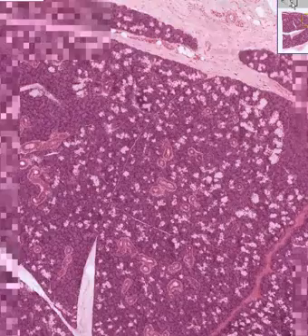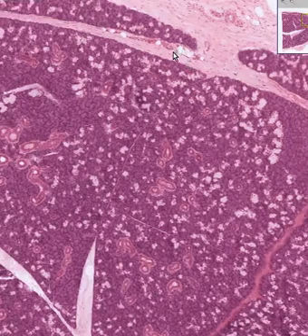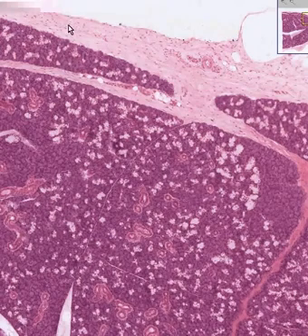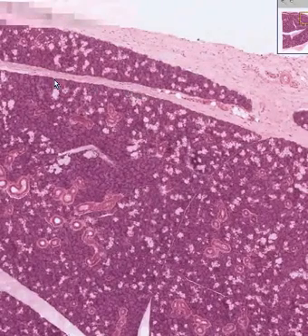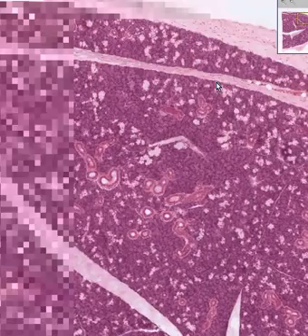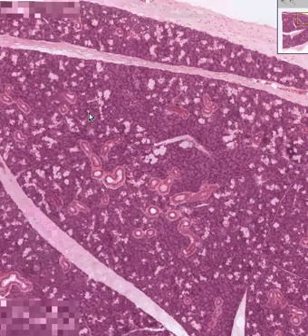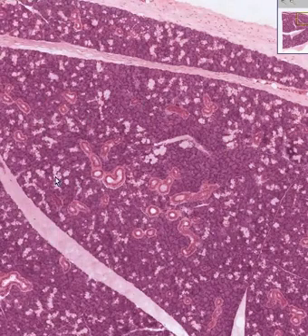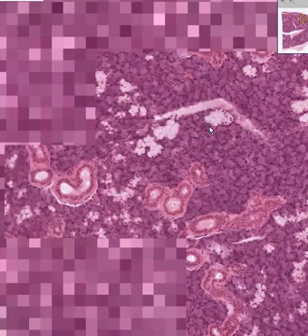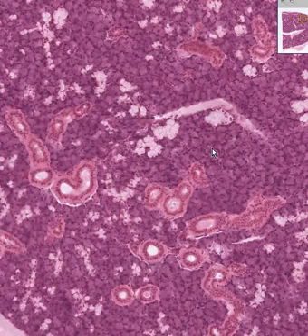But let's go back out and once again describe the classical histoarchitecture of a salivary gland or exocrine gland in general. You have a capsule. You have bands of fibrous tissue septae consisting of the spindly fibroblasts and collagen, separating and isolating the actual lobules. You can see that within the lobules you have a lot of these intralobular ducts, almost all of which are striated. And also in the lobule you have the acini, and in many areas the acini are 100% serous, but in some areas they're mucinous.